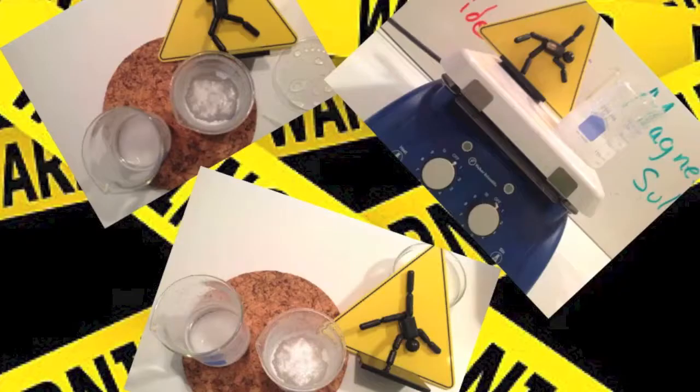Another thing we can do is give you some paper to put a few of the drops on to record some of the changes there as well. And we're also going to provide magnifying glasses and possibly microscopes for you to look at and draw the shape of the crystals. It's important that you find the nice crystals and draw their shapes. And that's really one of the results we're looking for.